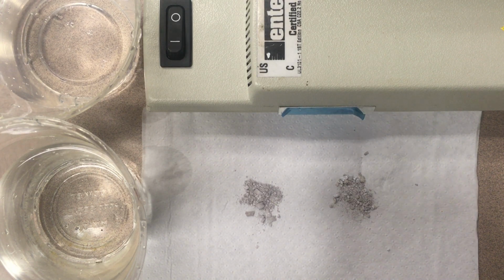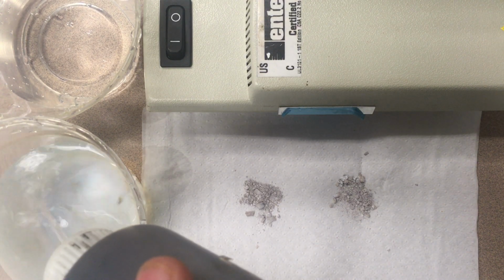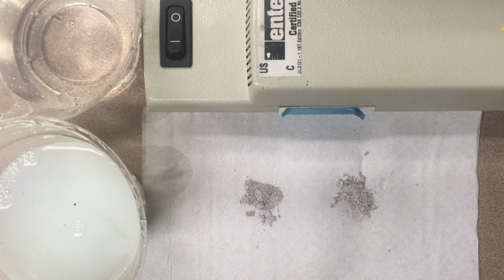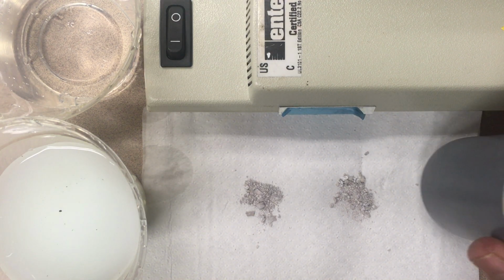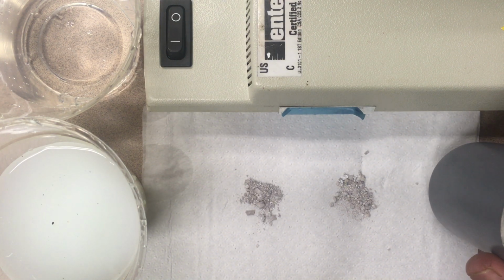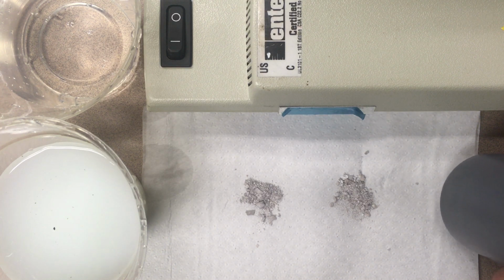So now I'm going to add this same solution to tap water, and you can see that the tap water becomes a bit cloudy here because there's a precipitate forming, probably between chloride ions and silver ions in solution, and maybe even some carbonate ions and silver ions in solution. So in fact, adding silver solution to water is a good way to test to see if the water is actually deionized or not. And you can see that obviously the tap water is not deionized.